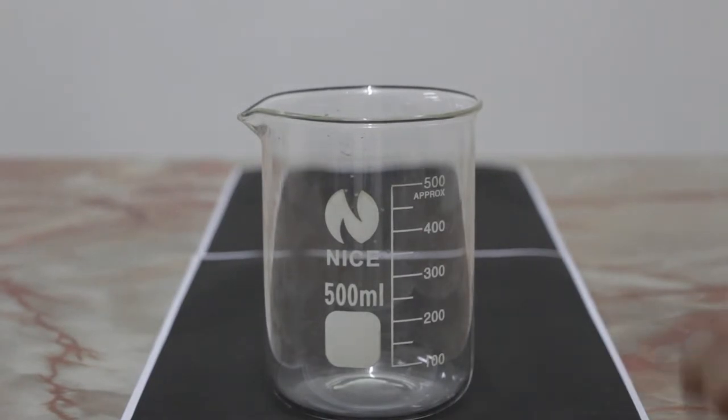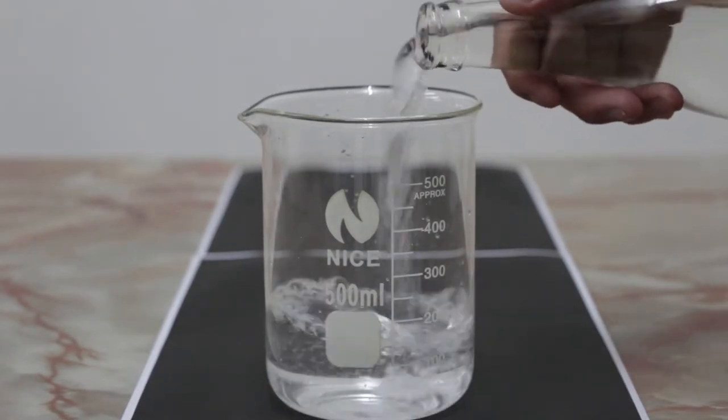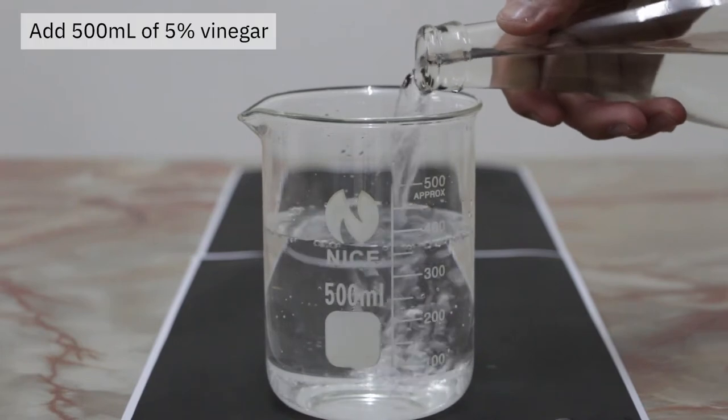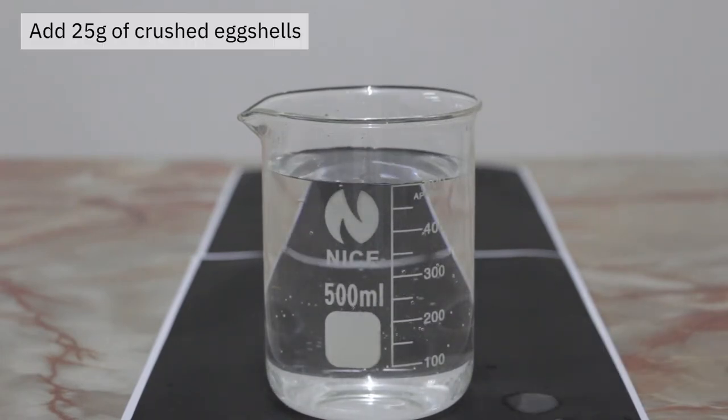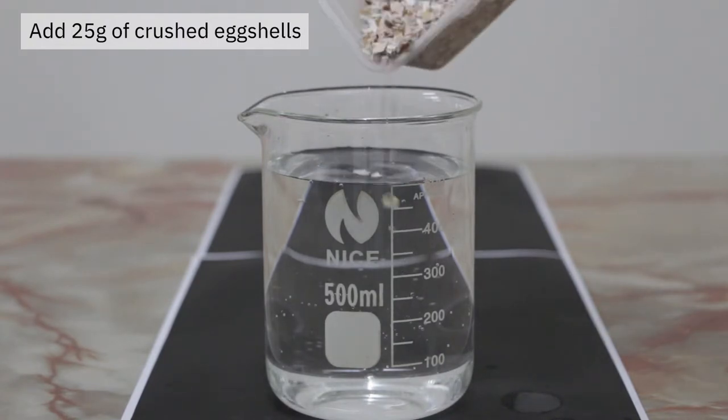The next part of the experiment involves synthesizing acetone. 500 ml of 5% vinegar is prepared. Then, 25 grams of crushed eggshells is slowly added to the solution.